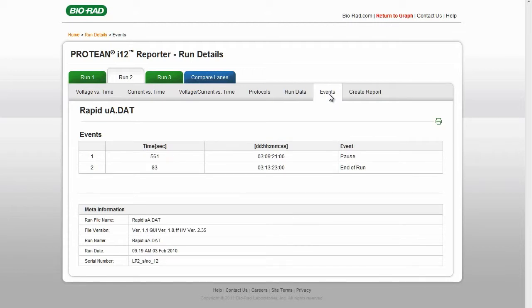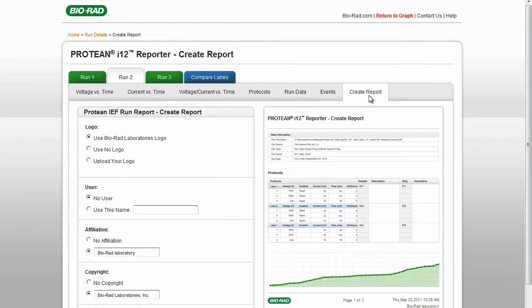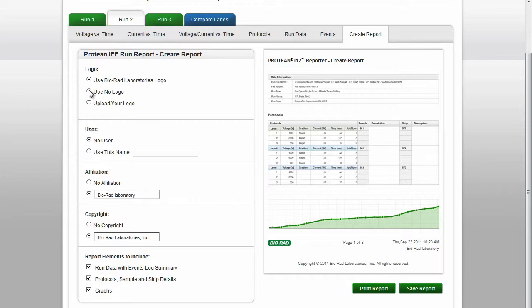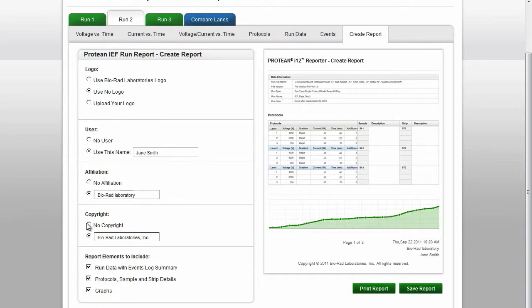Click on Create Report to customize your report. You can choose to use the BioRad logo, upload your own logo, or use no logo at all. You can add a user name.